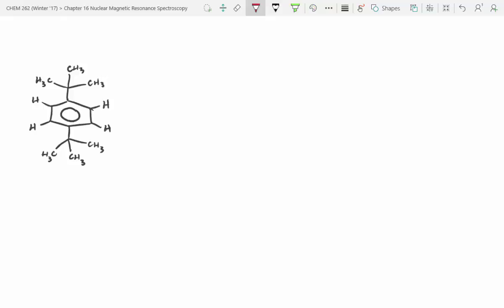Okay, so let's check. I'm just going to arbitrarily box one. I want you guys to help me find others that are like it. So the protons coming off this methyl group, are there any other like it? Yes. Which ones? All of it. All of the methyl groups.